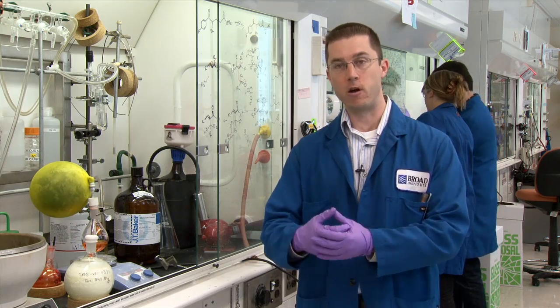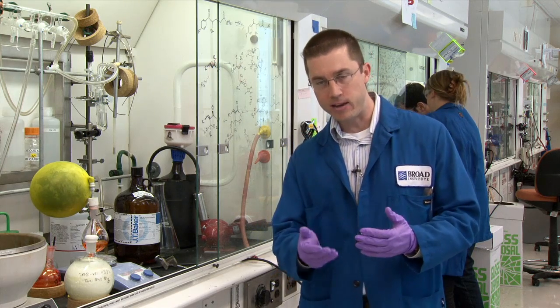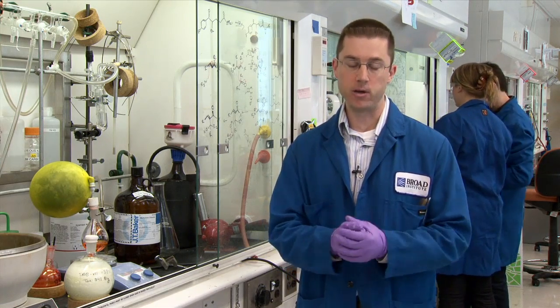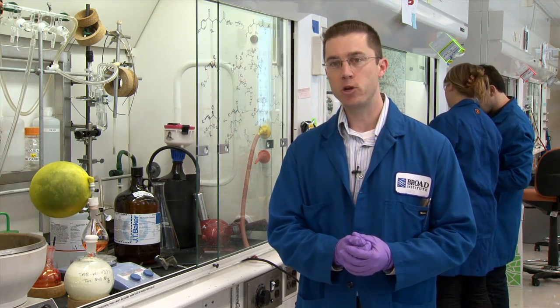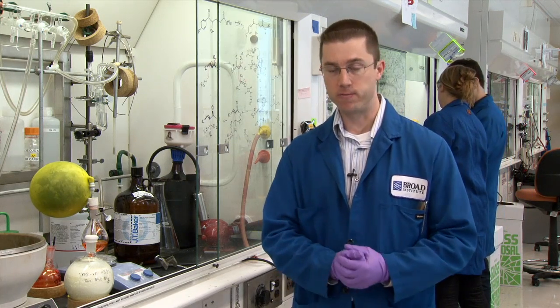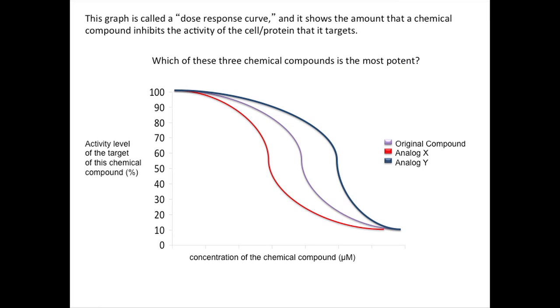So finally, to determine if the compounds are more potent, we will examine a dose response curve of the compound after it's been given to the biologist and undergone further testing. A dose response curve is simply a measurement of a particular activity in an assay. It could be a cellular assay or a biochemical assay of some kind. We have an example here for you. This is, for example, an assay against a cancer cell line, and we're looking to see which compounds provide the best inhibition of growth, for example, of a group of cells. So we'll pause here and you can take a look at these dose response curves and answer a few questions about the potency of the compounds.